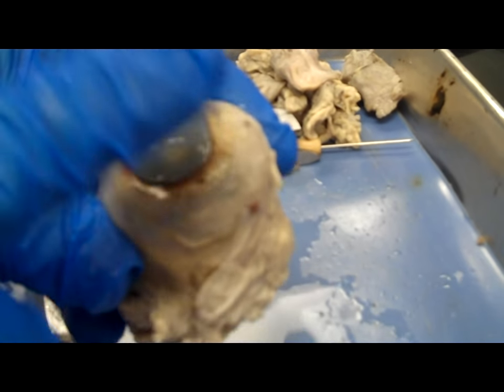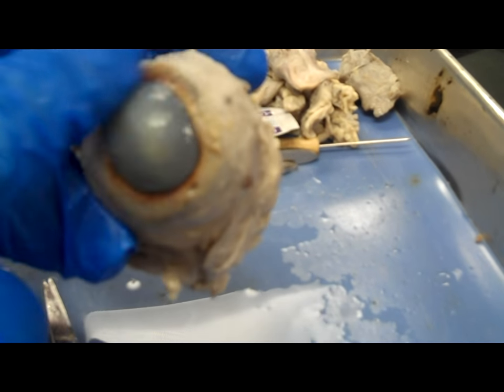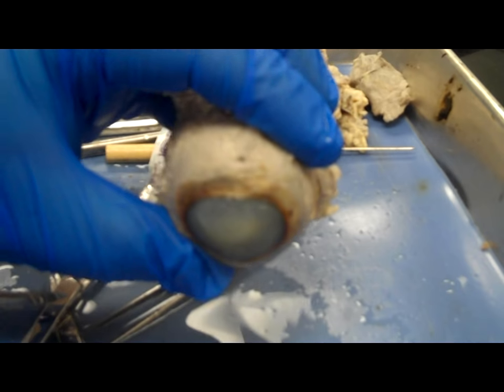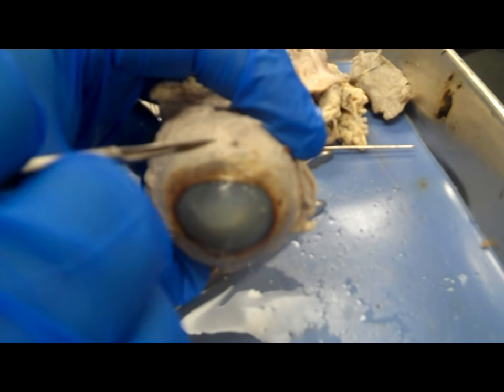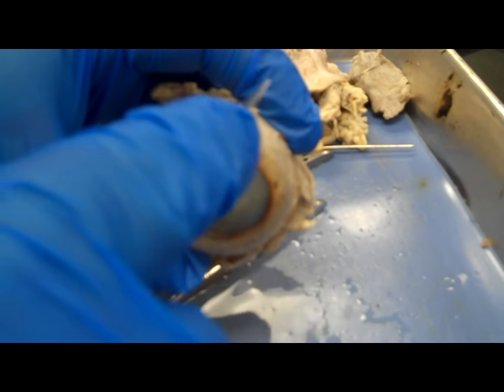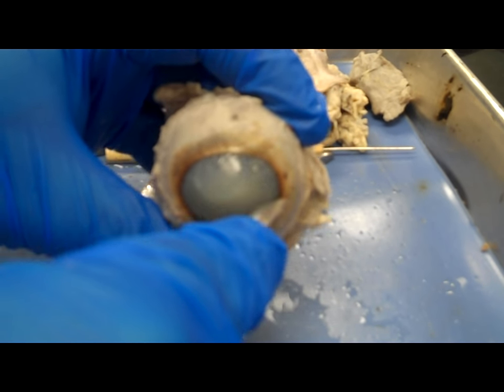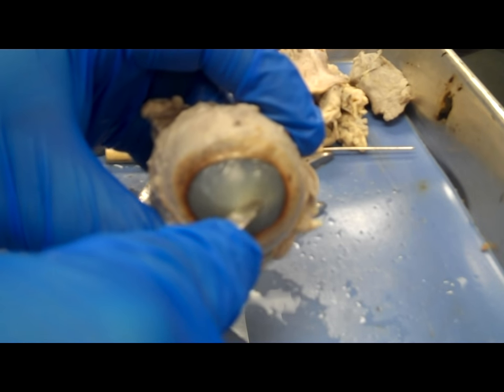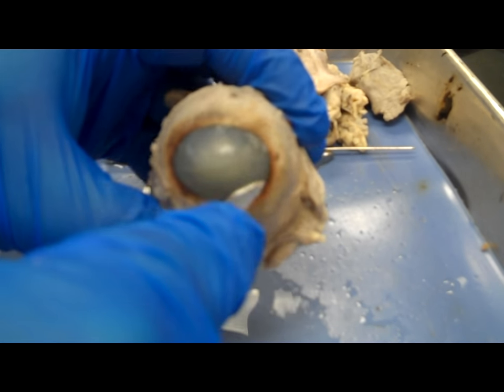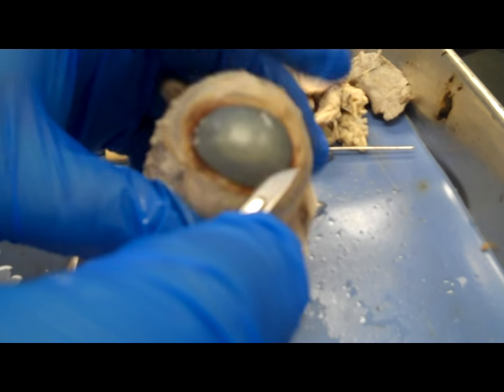At this point I'm looking at the cornea. The cornea is normally clear — had this been a fresher cow eye the cornea would have been clear. But because the animal is deceased, it turns a kind of opaque color. I want to hold my scalpel correctly and make a horizontal cut across the cornea. The cornea is really thick and tough, so it's going to take a little bit to get this cut really well.